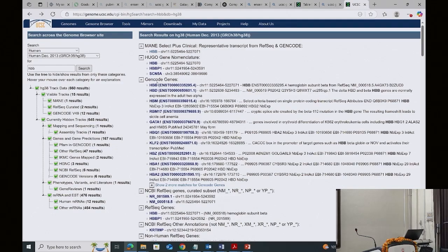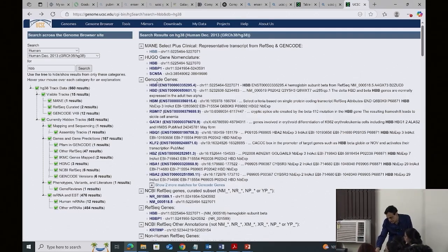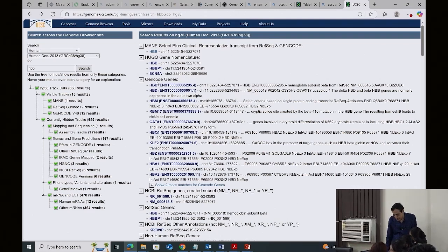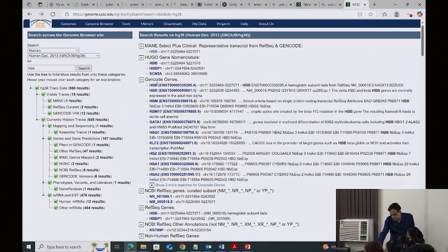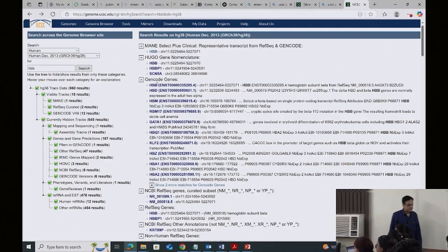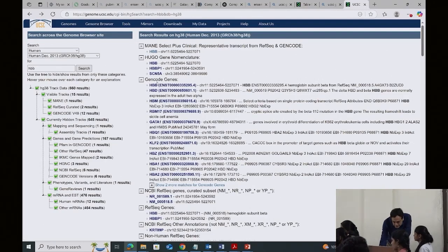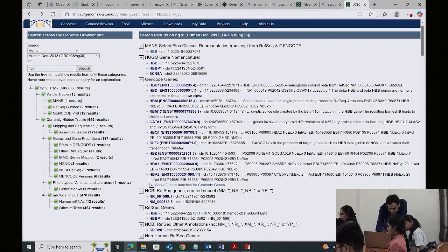In this, am I supposed to get a table or sequences? Yes, get sequences. Oh no, you will get... So do this. I think some mistake happened. You will not get sequences, but show me actually what you get. Oh, so you are okay. You got this, and then tools, and then table browser.